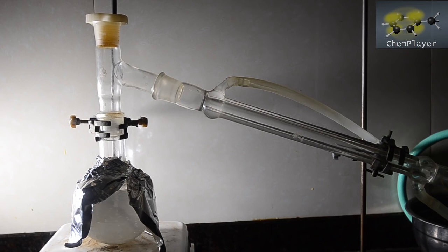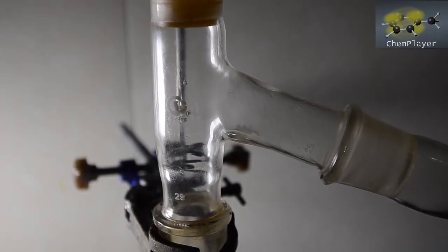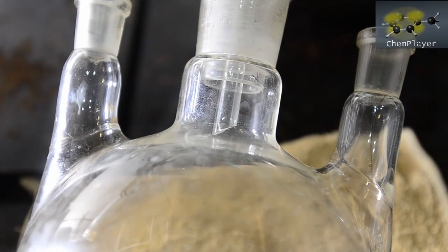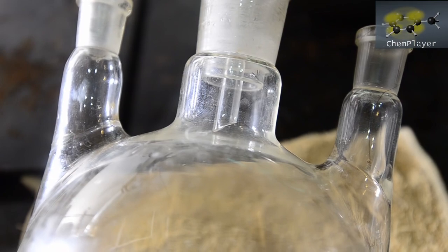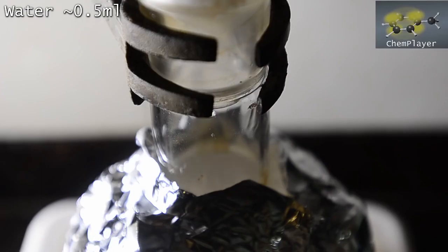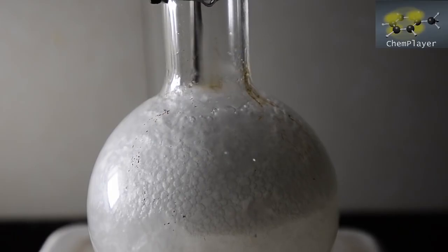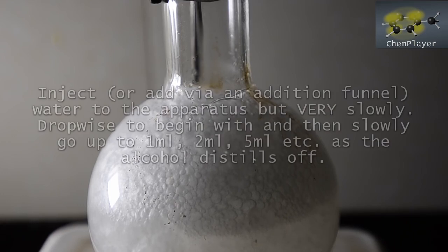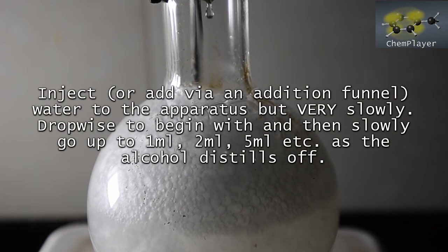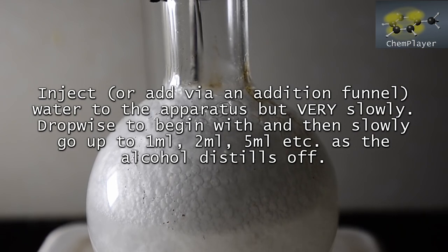So we set up for distillation. Pretty quickly we've got ethanol coming off. After a while we did an experiment and injected a very small amount of water, just a few drops, into the boiling flask. It's a very vigorous reaction as the sodium ethoxide is hydrolyzed back to ethanol and sodium hydroxide. There's a white solid formed in the process as well.